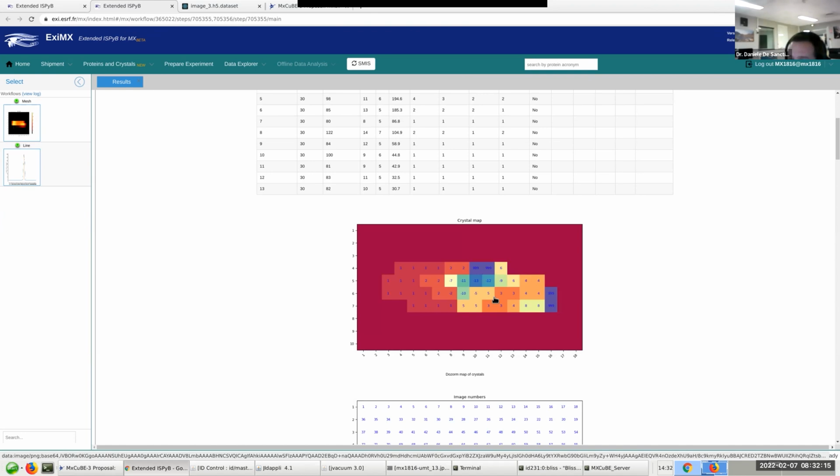The crystal map contains different images numbered with different numbers, and each individual number corresponds to, let's say, a region of homogeneous diffraction. So inside, for example, all the images flagged as 1, that's a single monocrystal. The other regions are subsets, or for example, they can be slightly offset, or there's a crack inside the crystal or whatever, or a rotation or a different level of quality. And so the most homogeneous region here was region 1. As we collected our diffraction images with a 30 micron beam, it suggested to use 50 because we can cover this much surface, of course.